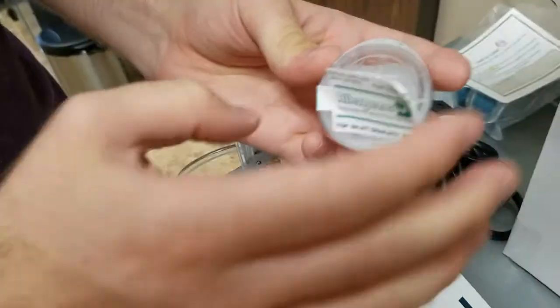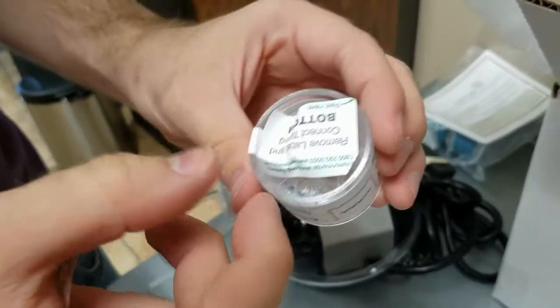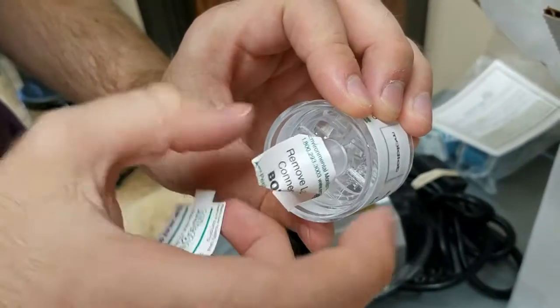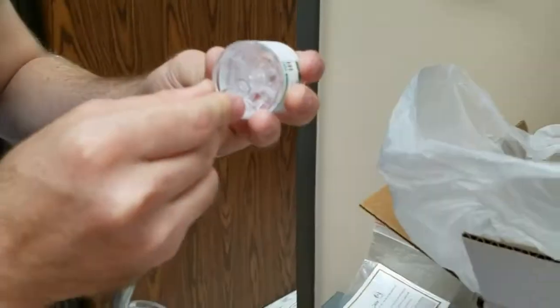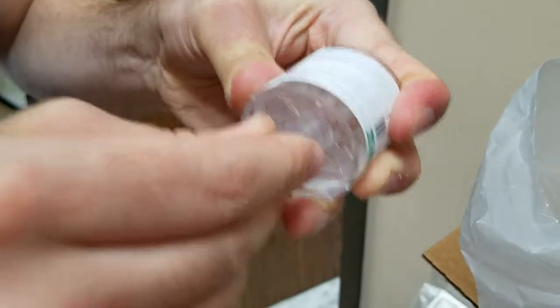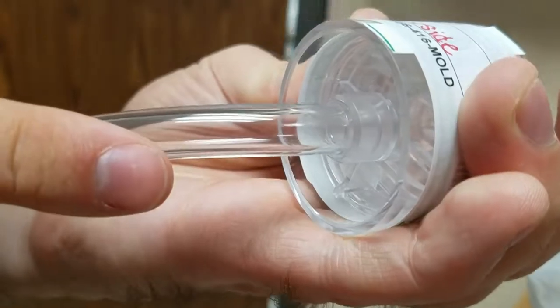Next, we need to peel off the stickers on both ends of the cassette. Then we'll connect the tube to the cassette. Make sure the tube is attached inside the circular part of the cassette.